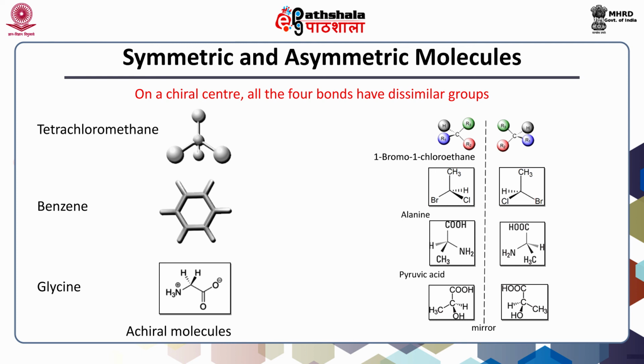Similarly, except for glycine, the alpha carbon in all the other 19 amino acids is chiral. All the molecules with a chiral center possess optical activity in the region of the absorption band, which originates from the electronic system of the chiral center. In macromolecules like DNA and proteins, the origin of asymmetry is conformational. That I shall discuss in circular dichroism in practice in another lecture.